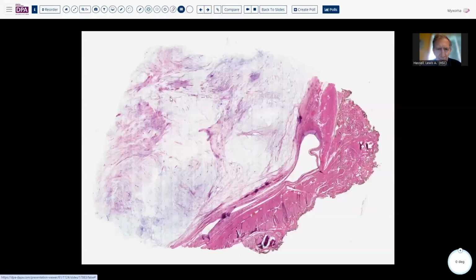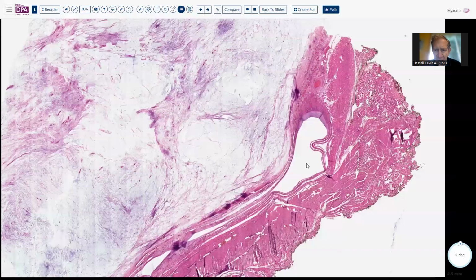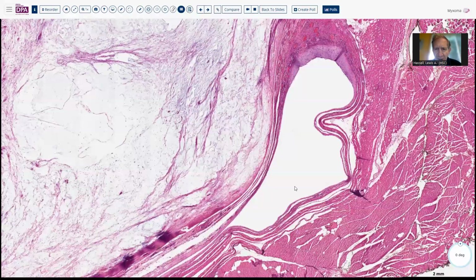An additional section here showing almost a pseudarthrosis. You remember she mentioned that it seemed to have a rolling character, and this may be one of those features. Perhaps that pseudosynovial type extension off of the lesion into adjacent tissues with that sharp fibrous border could have this kind of a correlate. Obviously, this has collapsed down here considerably.